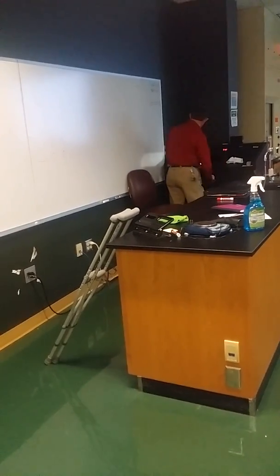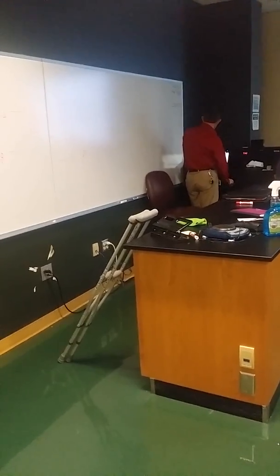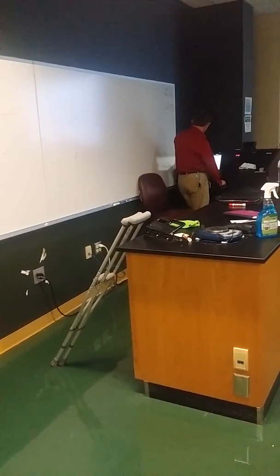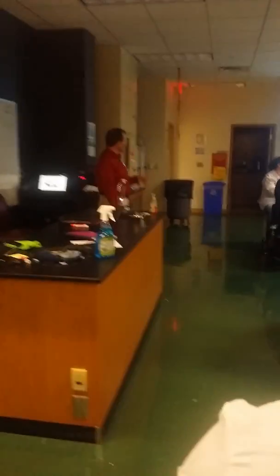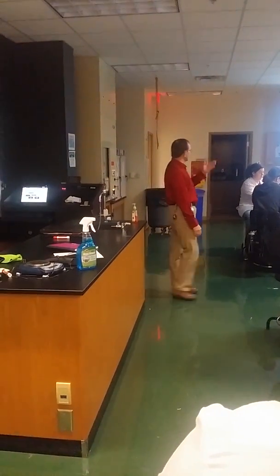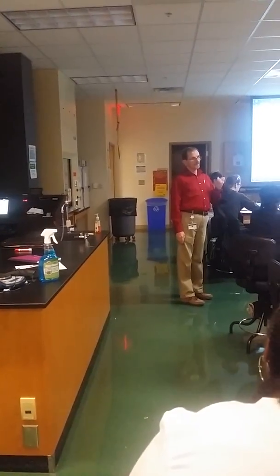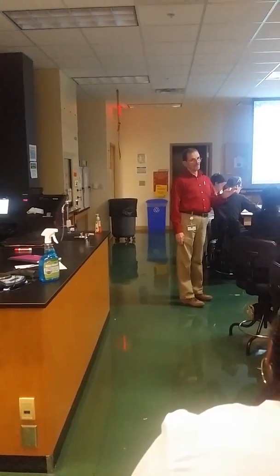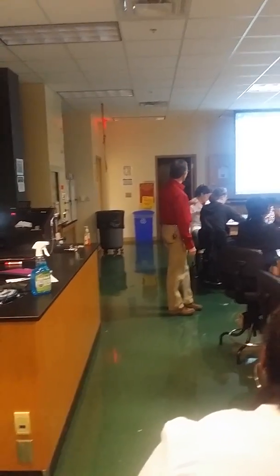Okay, so the first few days are pretty simple. So you're going to get one of these four, and we've got a chart for each of them. You got a gram-positive rod. Sorry, guys. First step in that is spore staining. The very first thing you got to find out is whether this is a spore-forming bacteria.